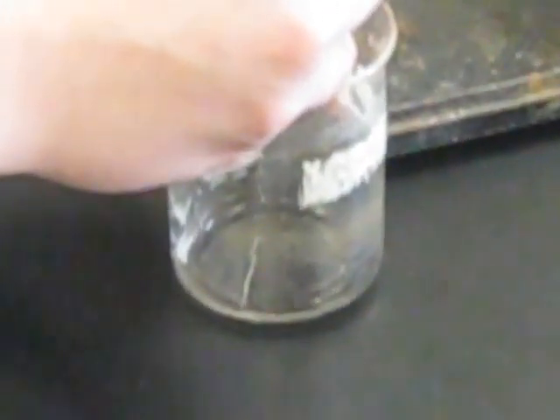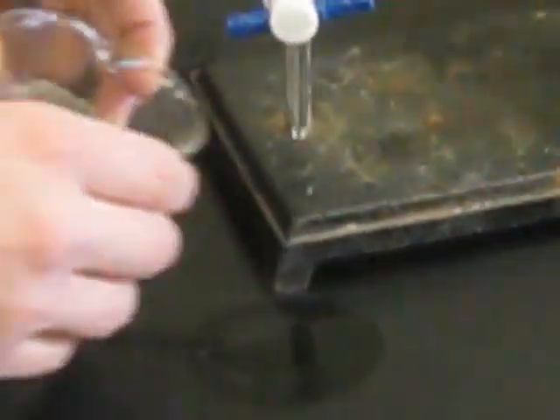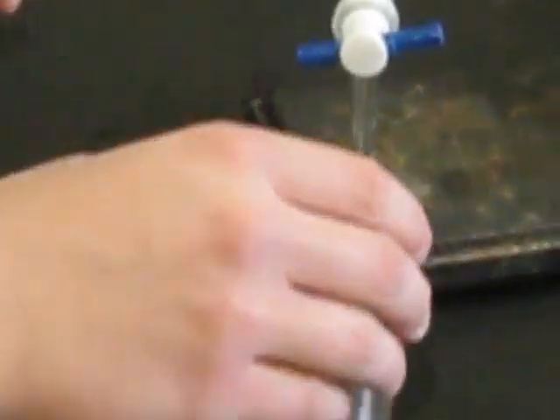And what we're going to see here is that the acid should start to turn a light purple and then become darker as you add base, but you don't want it to become too dark, otherwise you've gone too far. And what will happen is that pink color will fade as he swirls, but eventually that pink color will start to hang around and it'll get deeper.